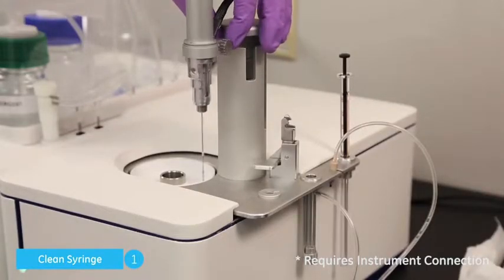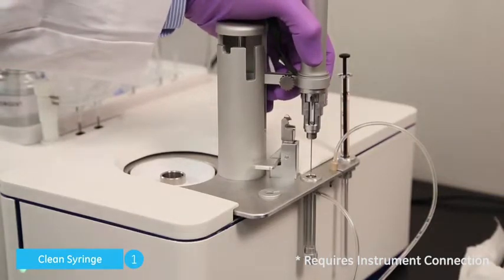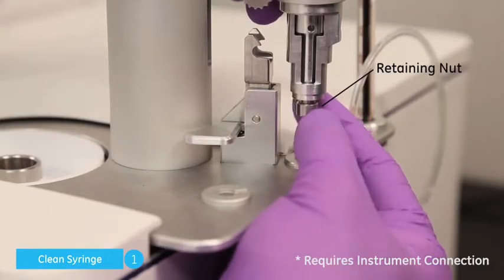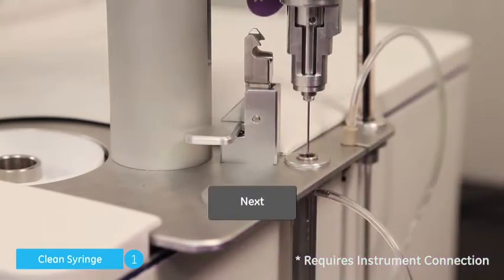Move the pipette partway into the clean location. Grasp the rotating assembly of the pipette with one hand, and with your other hand remove the steel retaining nut where the pedal stem meets the pipette, and click Next.